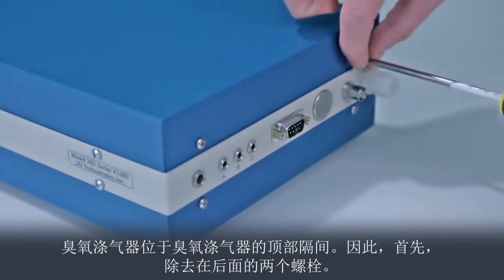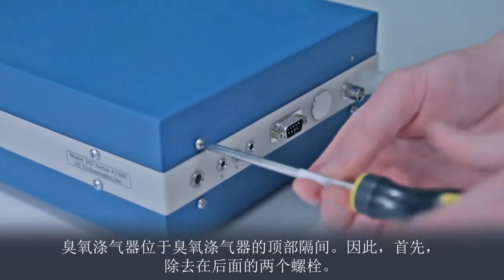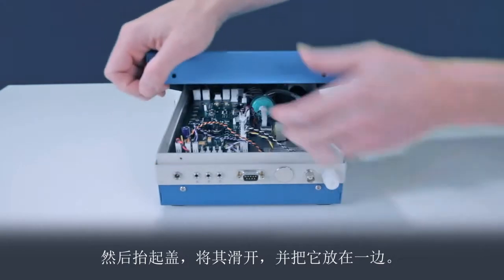The ozone scrubber is located in the top compartment of the ozone monitor. First, remove the two bolts at the back, then lift the cover, slide it off, and set it aside.